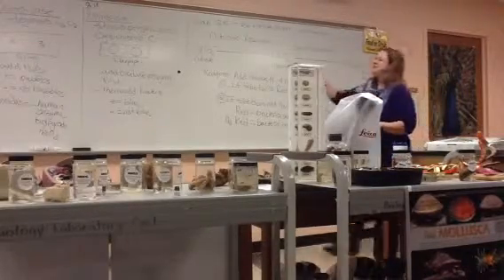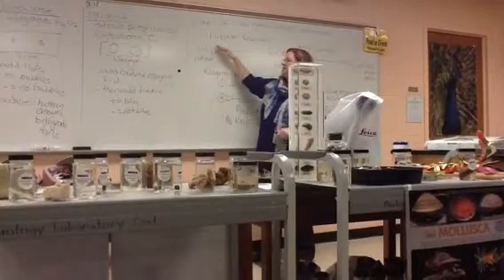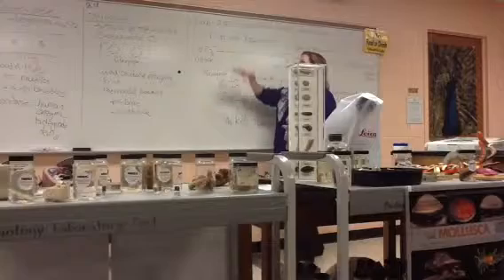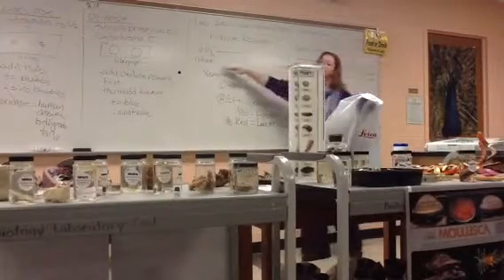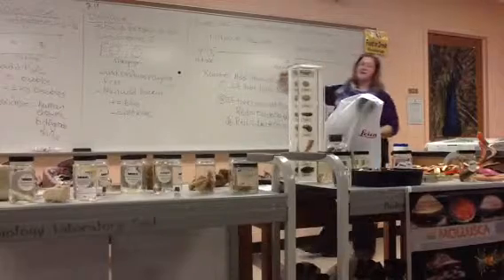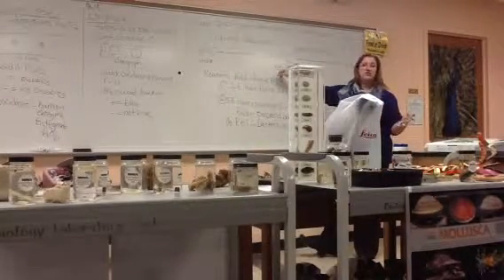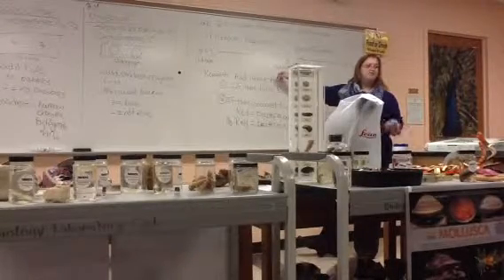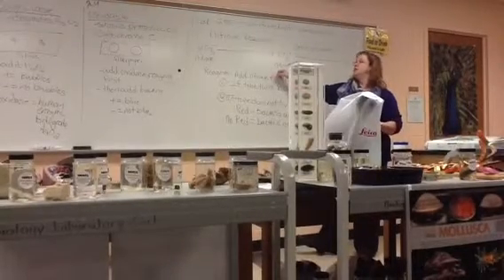All right. So, nitrate, obviously a nitrogen-containing compound. NO3 minus, it's a negative charge there for the formula for nitrate. Some bacteria are capable of this arrow, nitrate respiration, where they convert nitrate into nitrite, NO2 minus. So nitrate respiration is the conversion of nitrate into nitrite. And some bacteria are capable of it, and some aren't, just like every other test we've done.